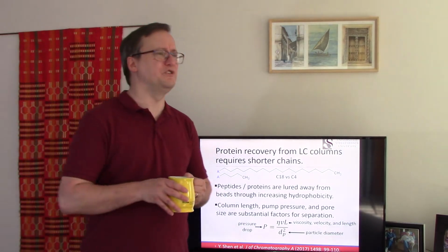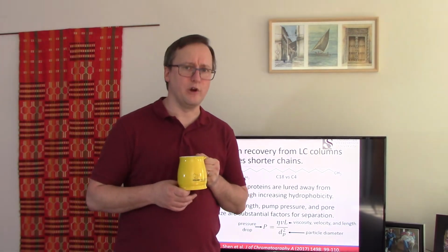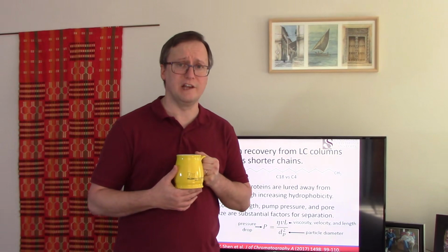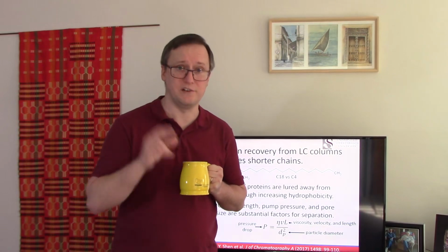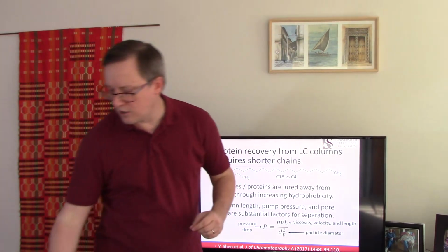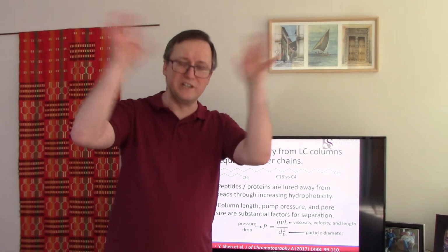All right, so how do we deal with the separation problem here? If you are accustomed to shotgun proteomics, you're probably very accustomed to thinking of reversed phase liquid chromatography. And in most cases, when we are separating peptides, the beads we use for RPLC are covered in C18 resin. So we have beads that have these long hydrophobic chains, these C18 chains pointing off in all directions.